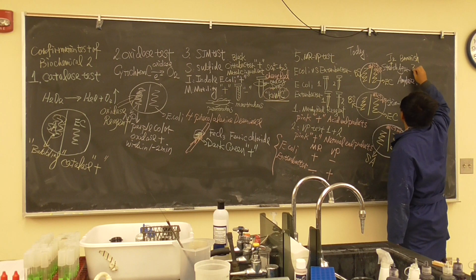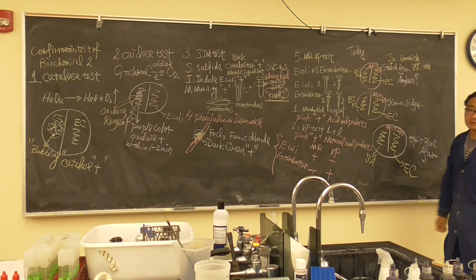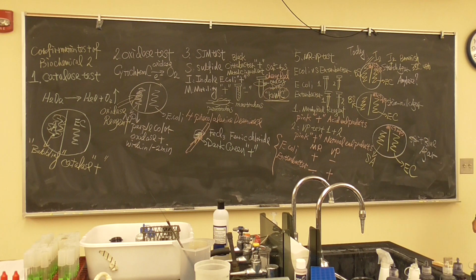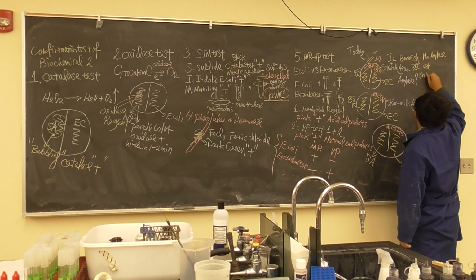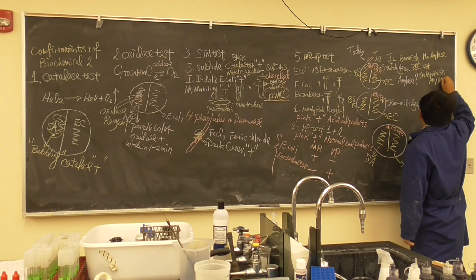So, after incubation, 35 degrees Celsius, 48 hours, we need to dump iodine. If you see it shows brownish color, what does this mean? The starch is still there. So, no amylase. If you see no brownish color, the amylase is positive.